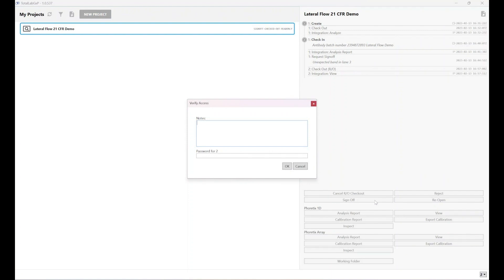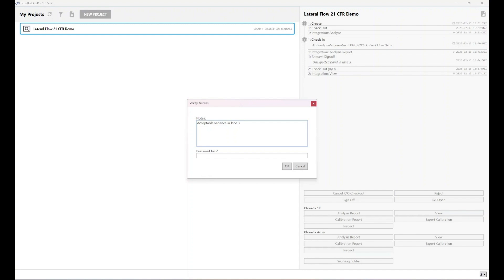I'm going to sign off the project. If I click on sign off, again, I get an option to insert any notes related to sign off. The analyst said there was an unexpected band in lane three as per the notes. And then I could come along and say, acceptable variance in lane three. It means that I, as the superior, the lab manager or someone of that position, I have definitely looked at the project. I've verified that what the analyst has seen, I am happy to accept the results regardless. It means there's a certain continuity through the audit trail that things have been raised and then questions have been answered, and that's all part of the audit trail.